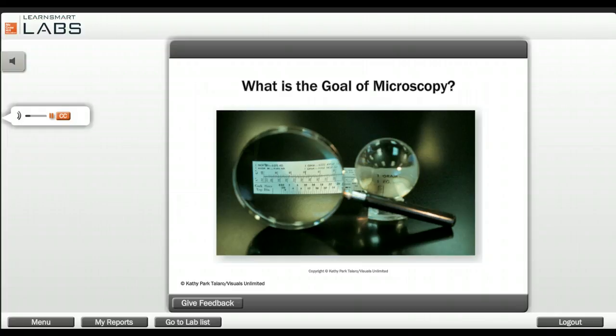A bright-field microscope, typically used in a general biology lab, enables viewing of both eukaryotic and prokaryotic cells. For example, you can use a microscope to look at tissues of the human body, plant cells, fungal structures, and even unicellular microorganisms. The greater magnification and resolution provided by an electron microscope is required to view viruses and large molecules.